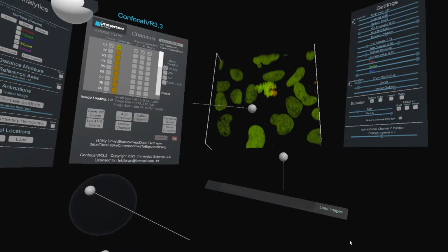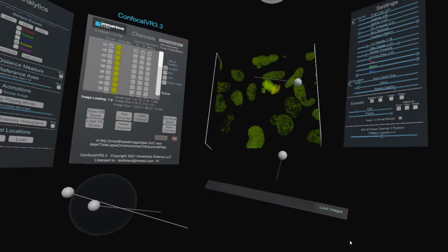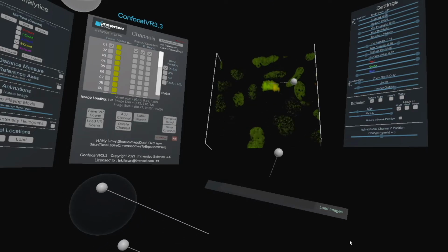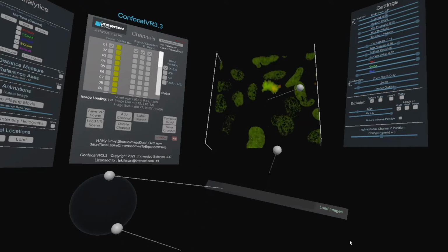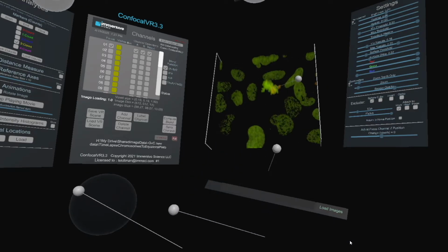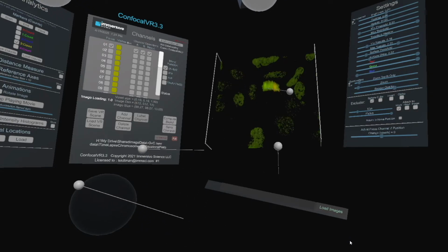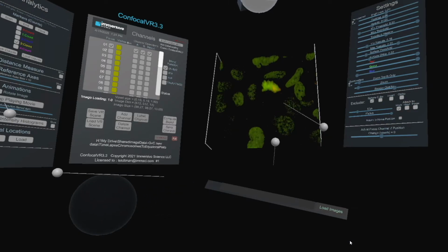So if we play the movie, are you ready? Then you see these chromosomes nicely going to an equatorial plate. And it's coming in the other direction than you would expect, I should think. That would be the equatorial plate. But you see all the chromosomes nicely going in. And this is fantastic, that you really see these individual chromosomes nicely lining up on the equatorial plate.